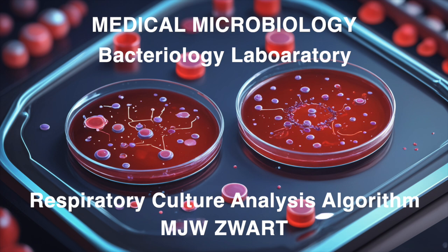What about cultures? Are those as important for URTIs as they are for LRTIs? Definitely, especially when we suspect a bacterial infection. For example, if we think it might be strep throat, we'll do a throat swab to check for Streptococcus pyogenes. So cultures help us pinpoint the culprit and make sure we're using the right treatment. Exactly. It's all about getting the right information to make the best decisions for the patient.